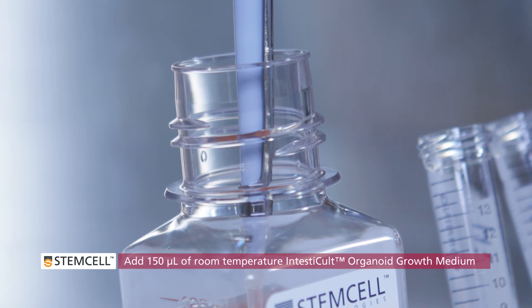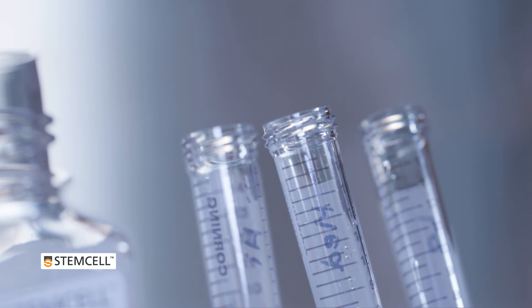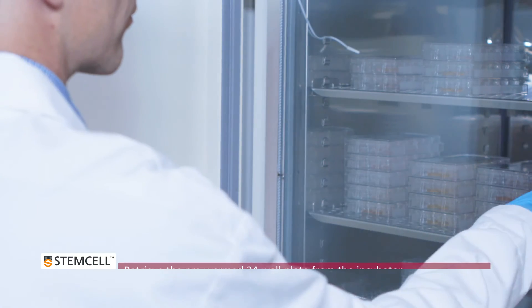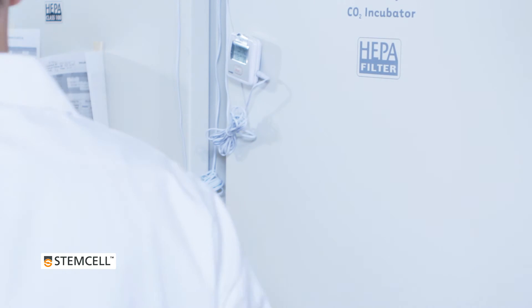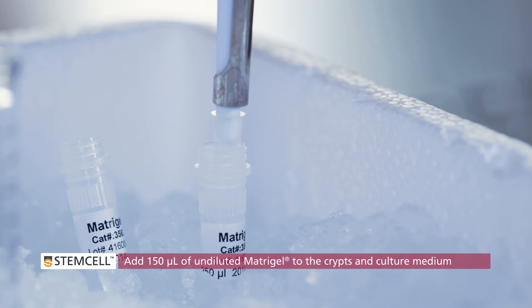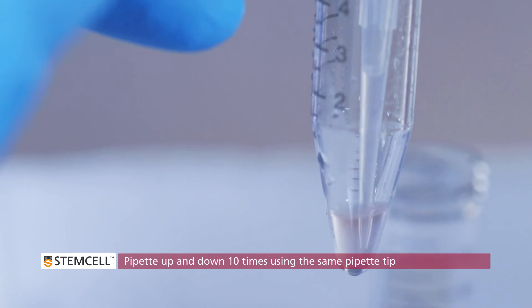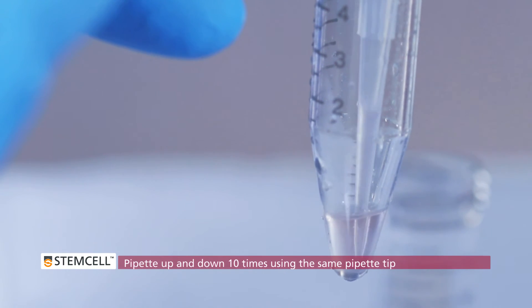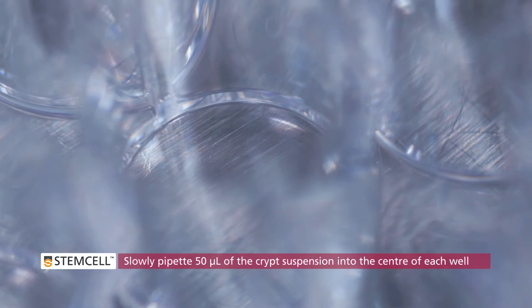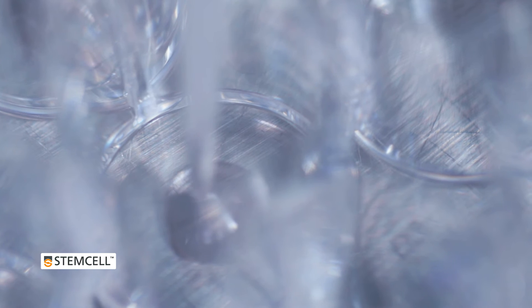Add 150 microliters of room temperature intesticult organoid growth medium to the pellets in each tube. Retrieve the pre-warmed 24-well plate from the incubator and place it on the bench top in readiness for plating the matrigel mixture you will make in the next step. Add 150 microliters of undiluted matrigel to the crypts and culture medium in each tube. Pipette up and down 10 times using the same pipette tip to thoroughly resuspend the pellet. Avoid introducing bubbles. Slowly pipette 50 microliters of each concentrated crypt suspension into the center of each of four wells of the pre-warmed 24-well plate.